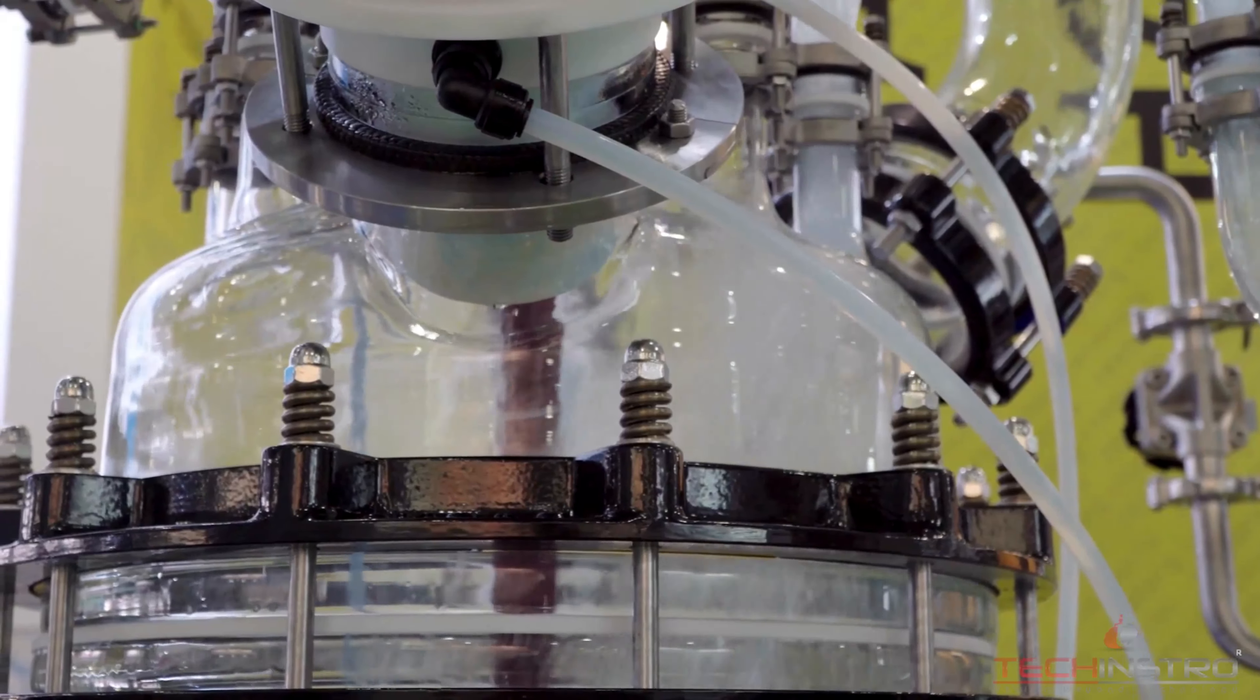Autoclave reactors often feature a heating system such as electrical heaters or jacketed vessels to control and maintain the reaction temperature. The temperature is raised to the level needed for the reaction to occur. This can range from moderate temperatures to very high temperatures depending on the nature of the chemical reaction.